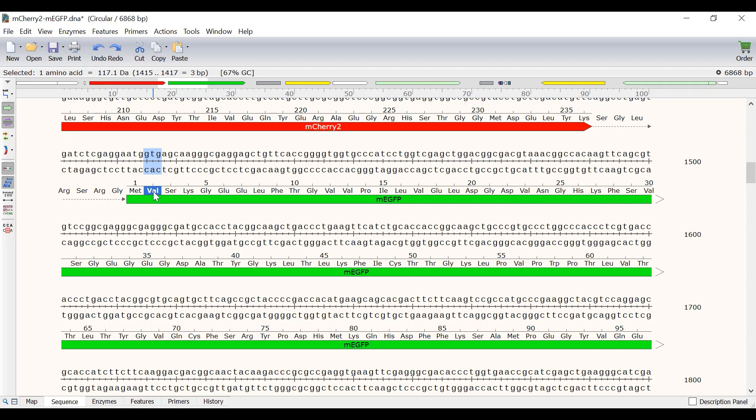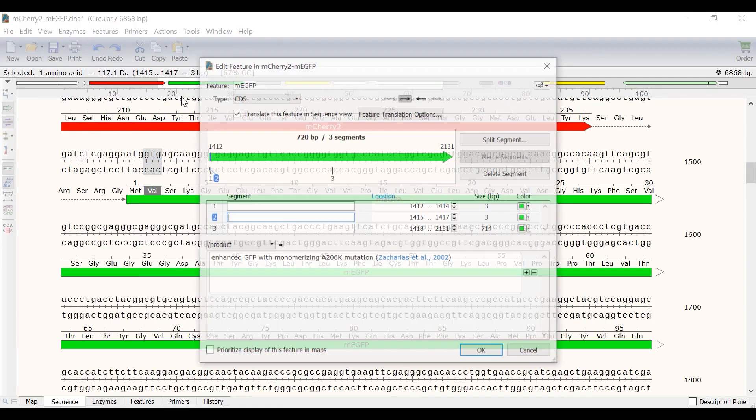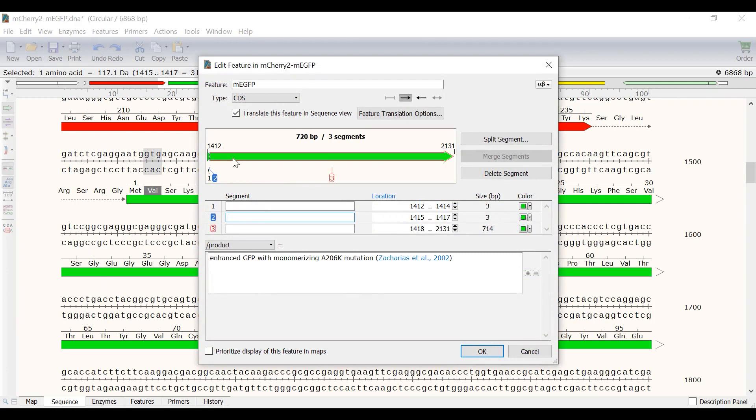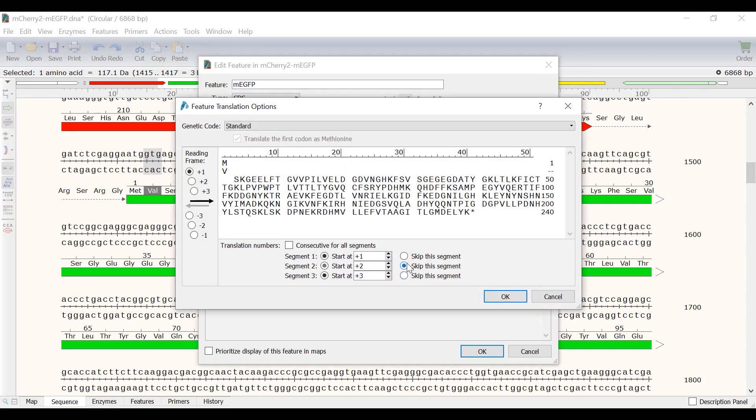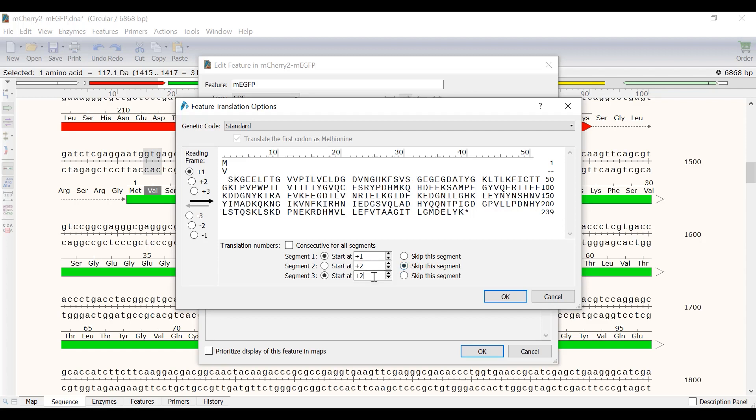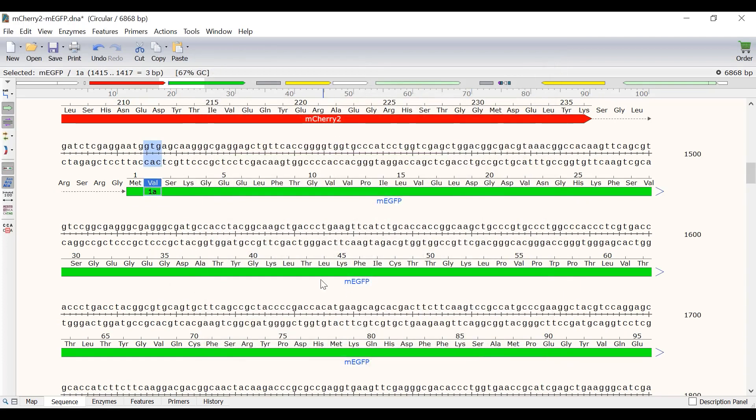To do this, I will select the valine and create a feature segment by going to Features, Create Feature Segment. I will call the new segment 1A to indicate valine 1A. Next, I will select the Feature Translation Options button. And in the new window, I will select to skip segment 2, which is valine 1A. I also want segment 3 to start at position 2. So I will change this to plus 2 instead of plus 3.